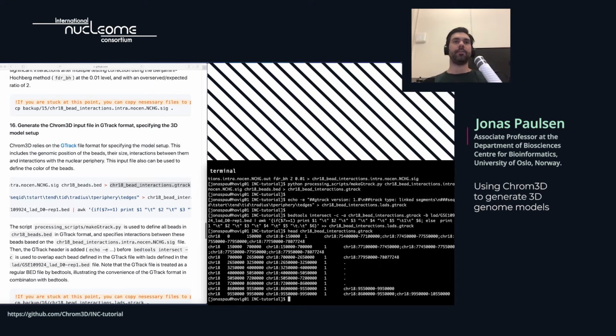As you can see, this file does not contain the header that we need. So that's actually what's done in the second step. It just echoes the header that we need and sends that into a new file.